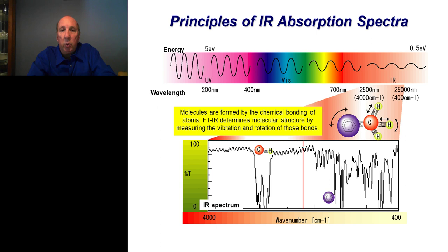And it was done so that you worked with whole numbers. You discussed whole numbers instead of 2,500.653, or things like that. Or the numbers got extremely large, like 24,561, something like that. So it's just a convenience for us in the industry to use those wavelength values.